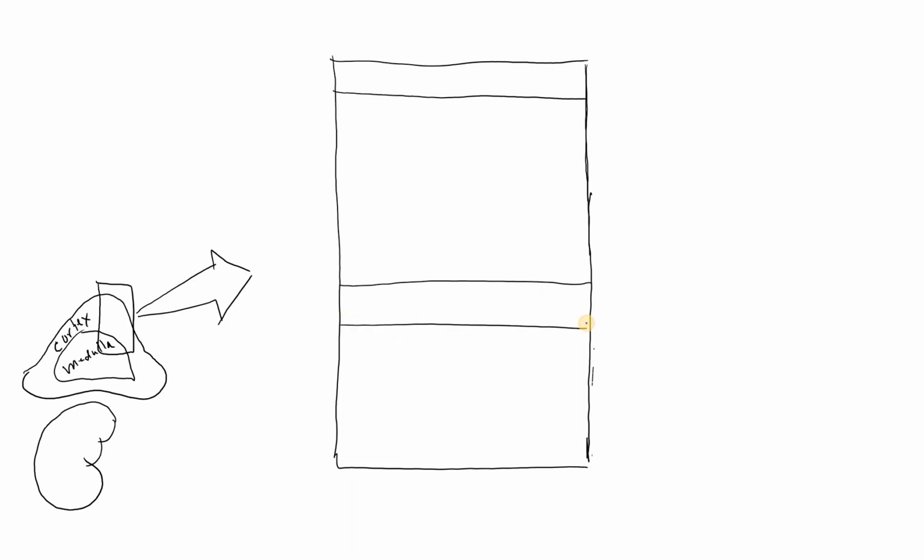And there's an area. So essentially we're looking at this as a space, this area as a space, and this as a space, and this. Okay? So 1, 2, 3, 4 different areas or zones we're going to look at here.